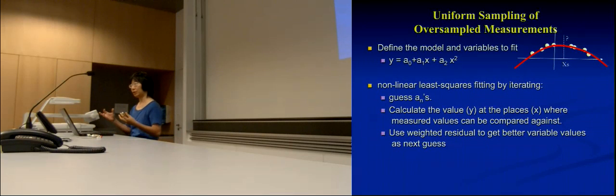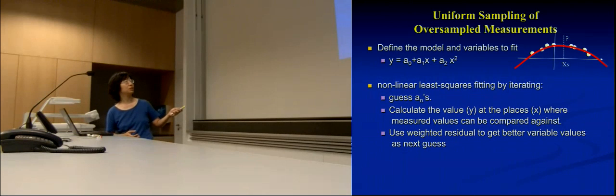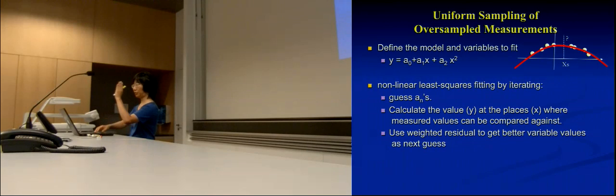And then you use one of those methods to calculate, and you take your function, you use those guess values for the parameters that you try to fit. Then for any x value, you'll be able to get the value of y according to your guess and your model. Then you will be able to compare your actual data with the value from your starting guess parameters. You take the differences, then you say, okay, I'm going to find out how far off I am.